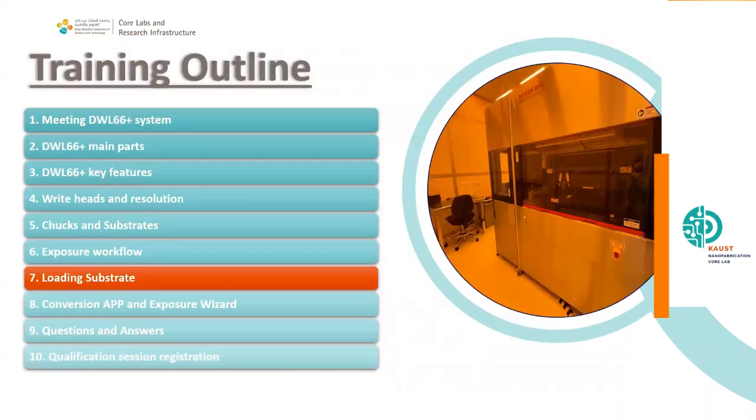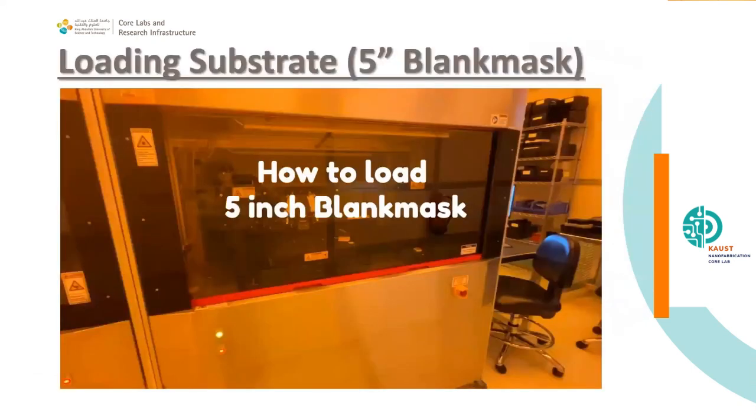And now I will go into how to load the substrate. From now onwards, the training will be focused on masks. I have one video to show you how to load a mask on the stage. If you come to the qualification, I will show you how to load a wafer too. It's exactly the same, but we only change the centering tool. So let's go and see the film on how to load a 5-inch blank mask.